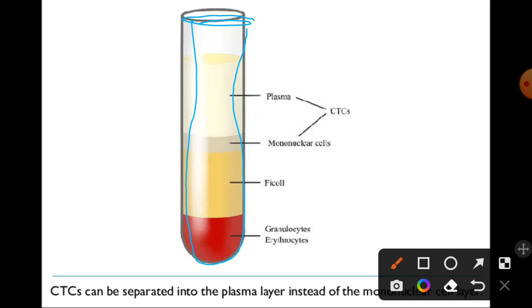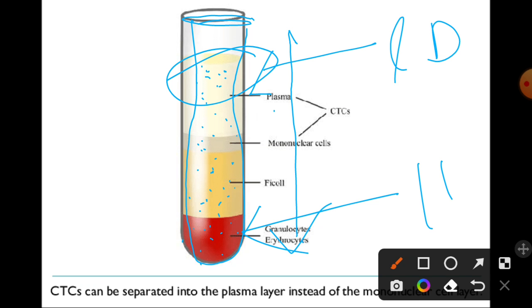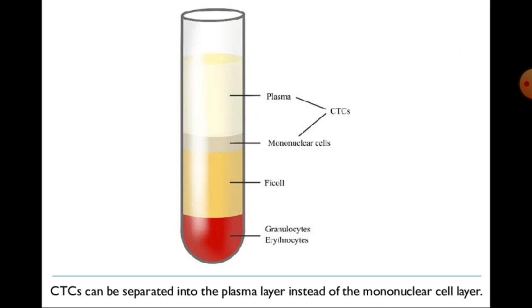Okay, that means the amount of solute is increasing from the top to bottom, and that ultimately facilitates increase in density. Okay, so here will be a density gradient from the top to bottom, meaning that the lowest density will be at the top and highest density will be at the bottom, and the medial area will exhibit intermediate density. Okay, that is the density gradient centrifugation if you are using such kind of matrix for centrifugation.